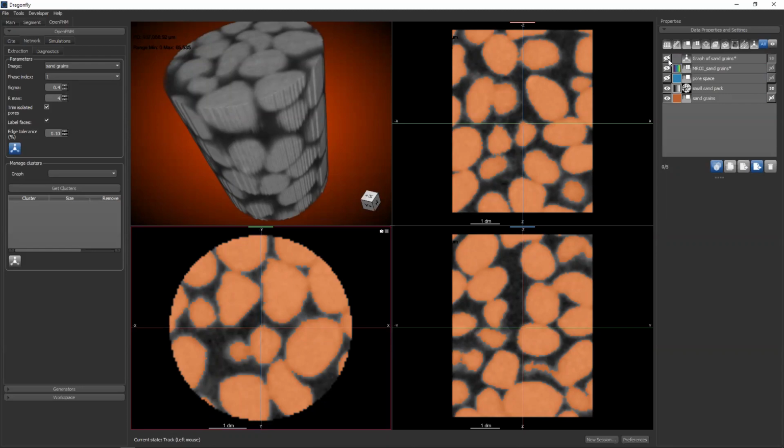This is not going to be the standard method for you getting a multi-ROI. What is a multi-ROI? A sand grains ROI labels all of these pixels as orange or not orange. A multi-ROI labels these pixels as grain 1, and these pixels as grain 2, and these pixels as not a grain at all. We'll talk many times later about how to get multi-ROIs and how to make multi-ROIs, but for today I just want to have a multi-ROI to work with, so we're using this. This is our multi-ROI of sand grains.